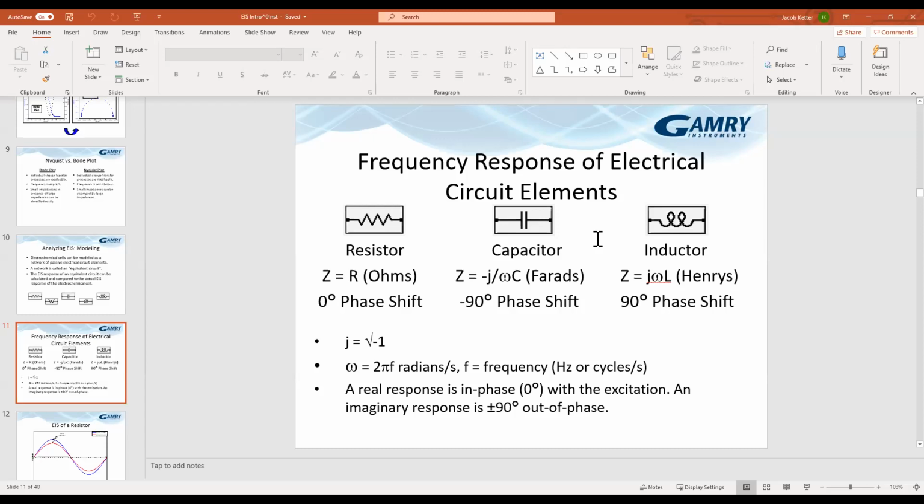It's not very common to see it. It's a lot more likely to see invalid data that looks like inductance at low frequencies. But if you have samples where you know they have things that adsorb to the surface, sensors, biosensors, for example, if you've got any thiol containing thing with a gold electrode, stuff that you do know adsorbs and can come off the electrode at certain polarization or at certain voltages, potentials, then you can have that inductance at low frequency.